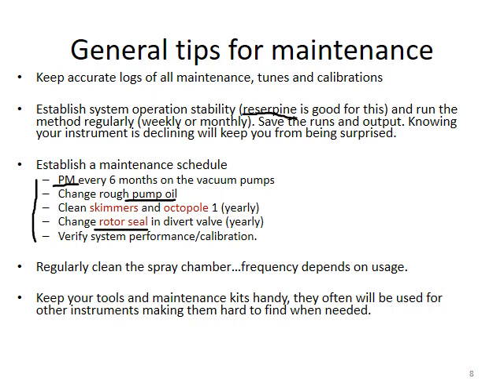After all the tasks have been completed, you have to verify the system performance. The source chamber, or what we call the spray chamber, is located at the very front, so contamination is very common. So you should regularly clean the spray chamber.